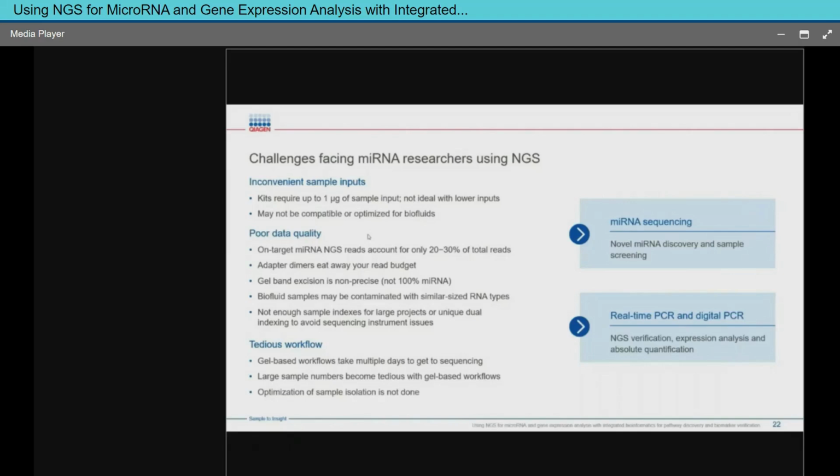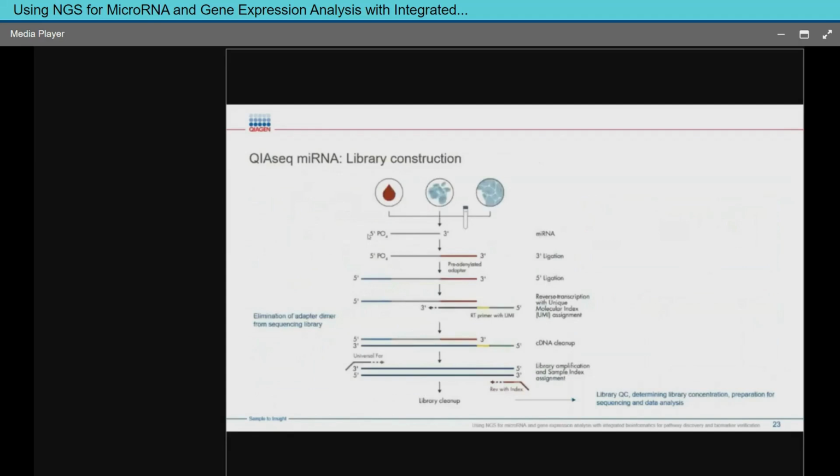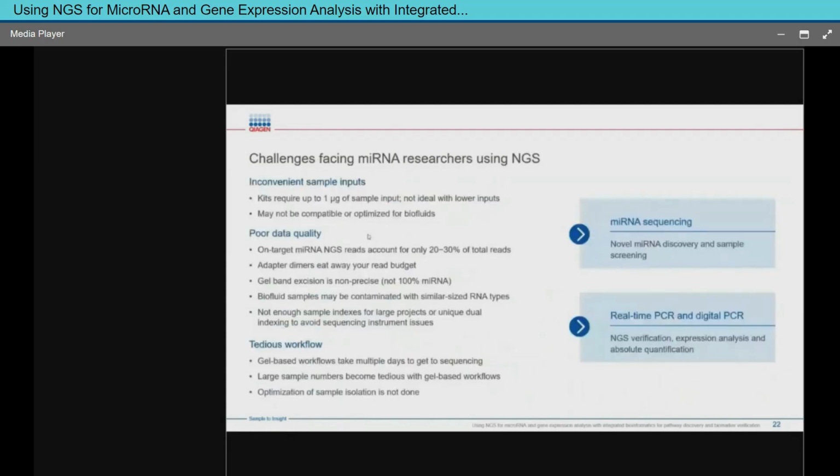If you're working on a biomarker project, a lot of these biomarkers really come from having a statistical argument that you have microRNAs that are different between the samples you're looking at. When we start our experiments and our pilot experiments, we might start and go through and do 3 or 6. That's a way to allow us to go through and identify something.